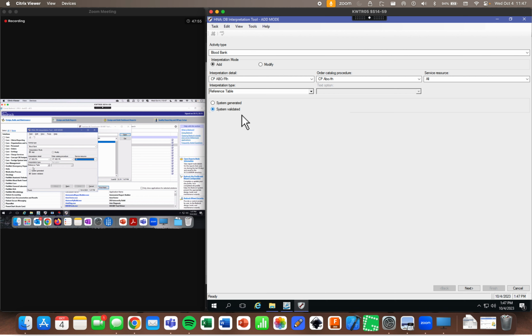Remember, it's only the ABORHs that utilize that reference table choice. If I'm sounding like a broken record, it's probably because it's a mistake that I see made over and over and over and over some more.